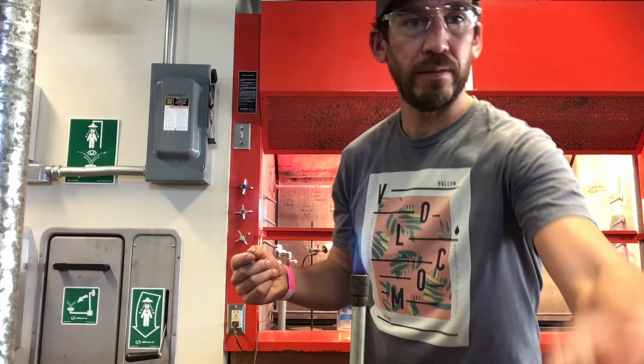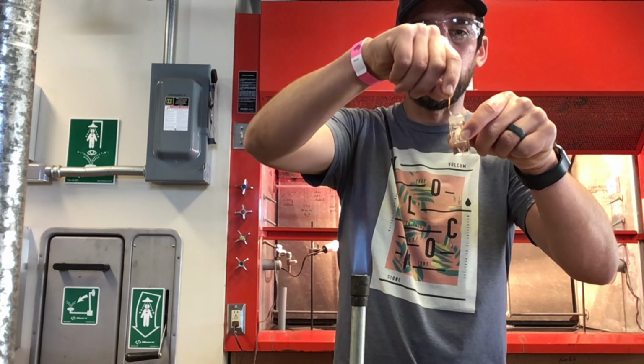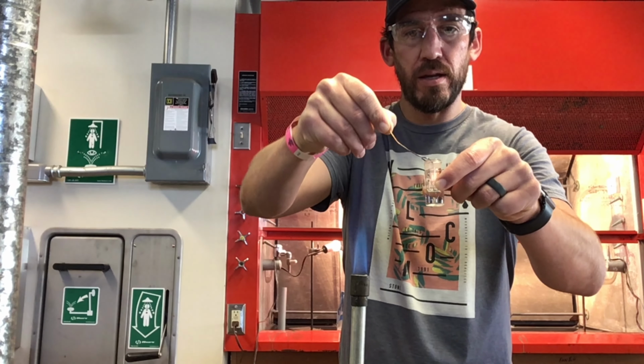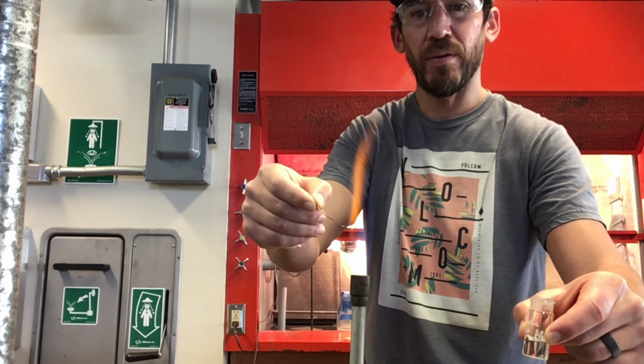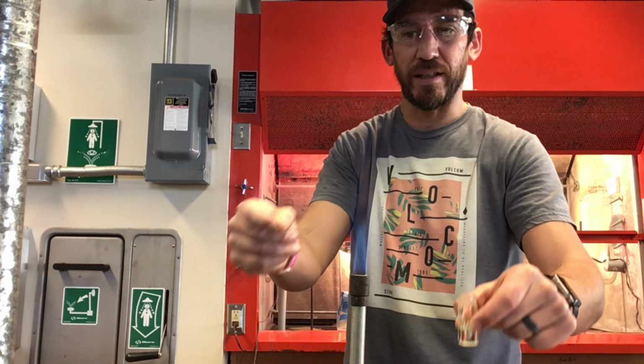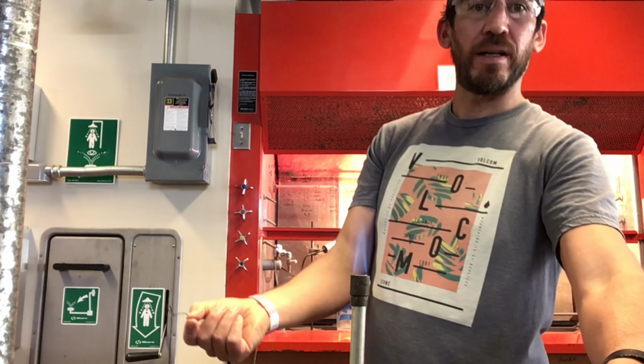I got a little bit of sample in here. All I'm gonna do is dip, dip, dip, dip, hooray! Light it on fire. Ooh, whoa, looks like some Harry Potter stuff right there, huh? What do you think? That was pretty cool. Let's see if we can get that angle better.